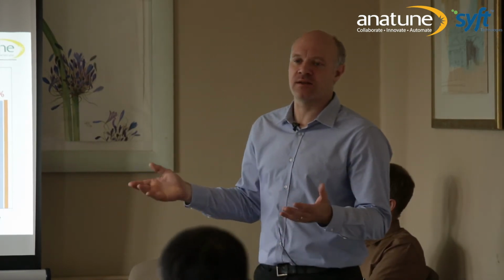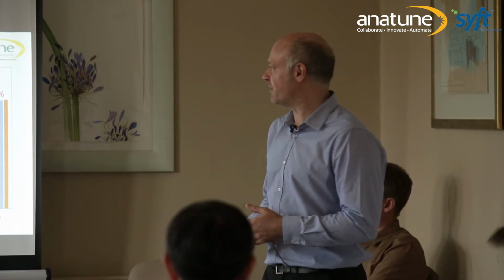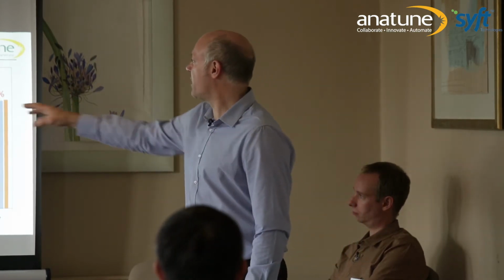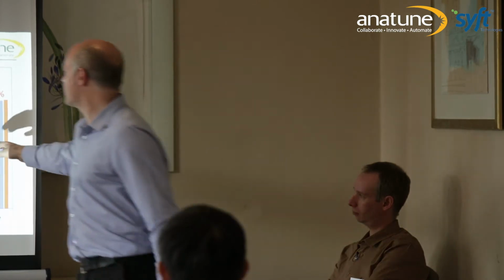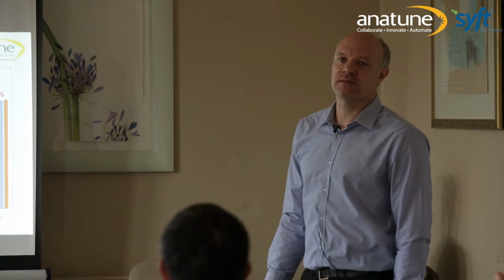They're less than 20%, and I've done some methods where 20% was perfectly reasonable in the past. Pharmaceutical as well, so if the pharma industry accepts 20%, I'll accept 20%. But up at the top end concentrations, the expected concentration range is here. Our RSDs are 5% or less. It's an inherently precise instrument. You know, we put the same sample in at the same time, you get the same results coming out.